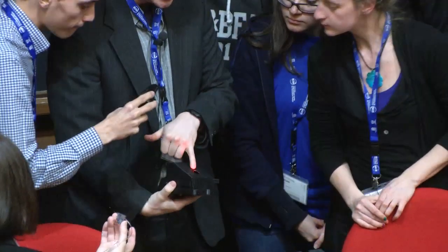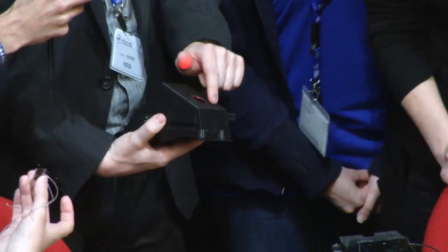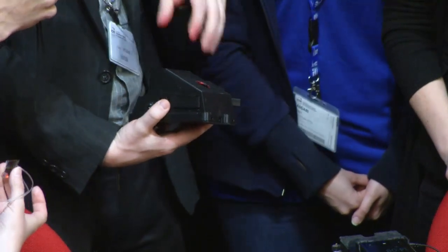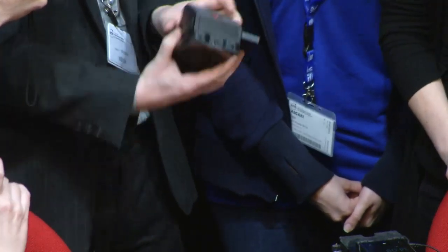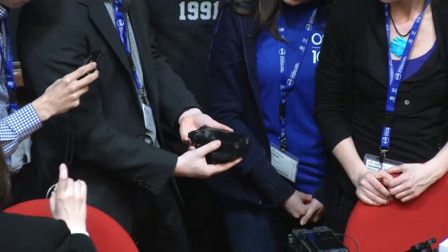device. So here is where the sample would go. You can see the emission filter there. We have this hole opened up to do bright field imaging with just ambient light. So you can hold it up like this and take an image just to make sure your sample's aligned. And then you can put it on the table like this. It covers up the hole. And then you can do your DNA imaging, or sizing.